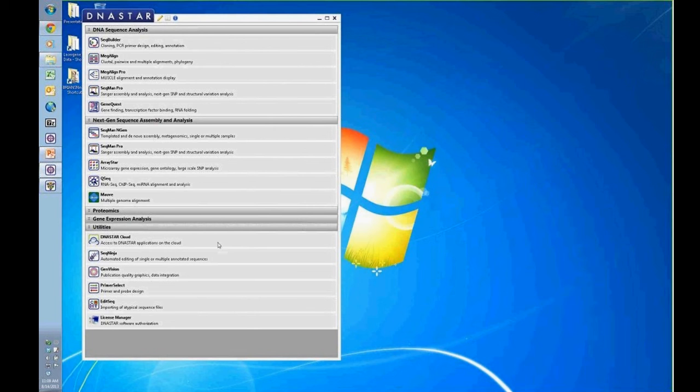So this is a very helpful interface that we, within the last couple of versions, have added to the software. This is a very helpful tool that will get you to know the software if you're a new user, or maybe if you're a long-term user, teach you something that you may not know existed in the application.